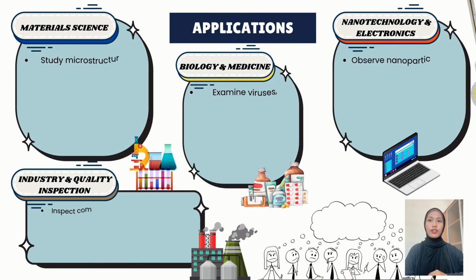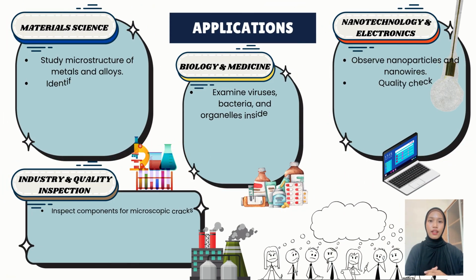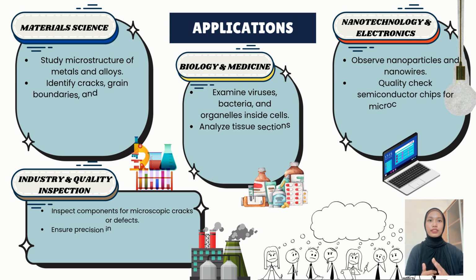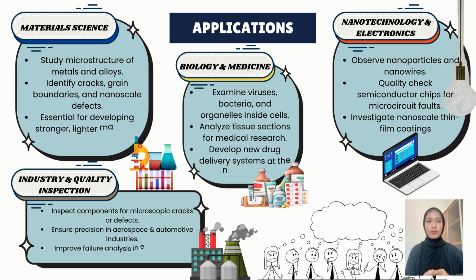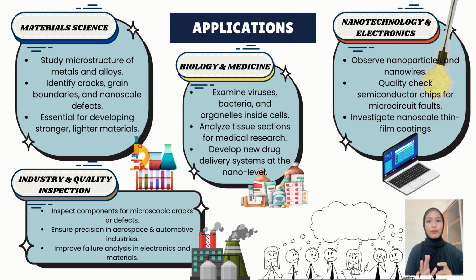Alright, let's move on to the applications. First, we have material science. Electron microscopes actually help scientists look super closely at metals and materials.